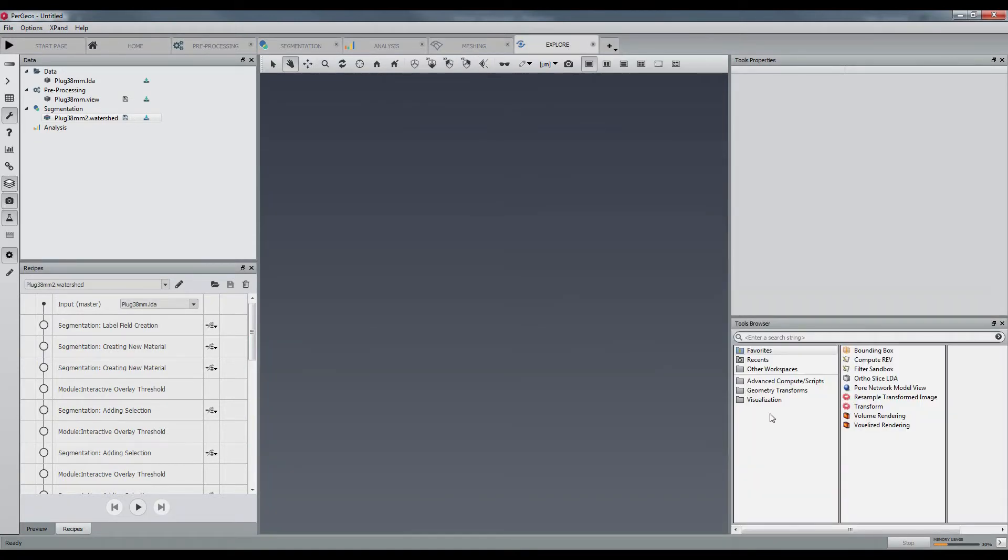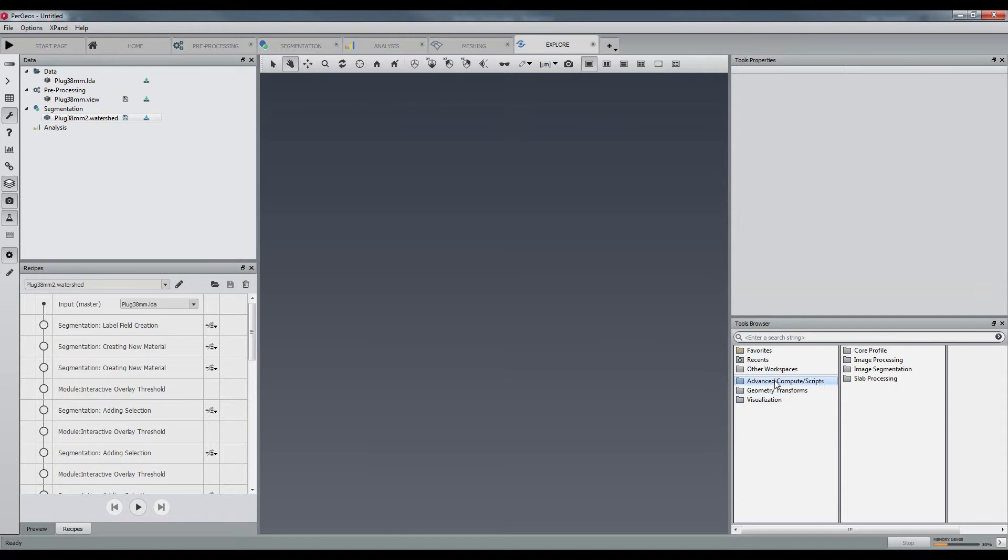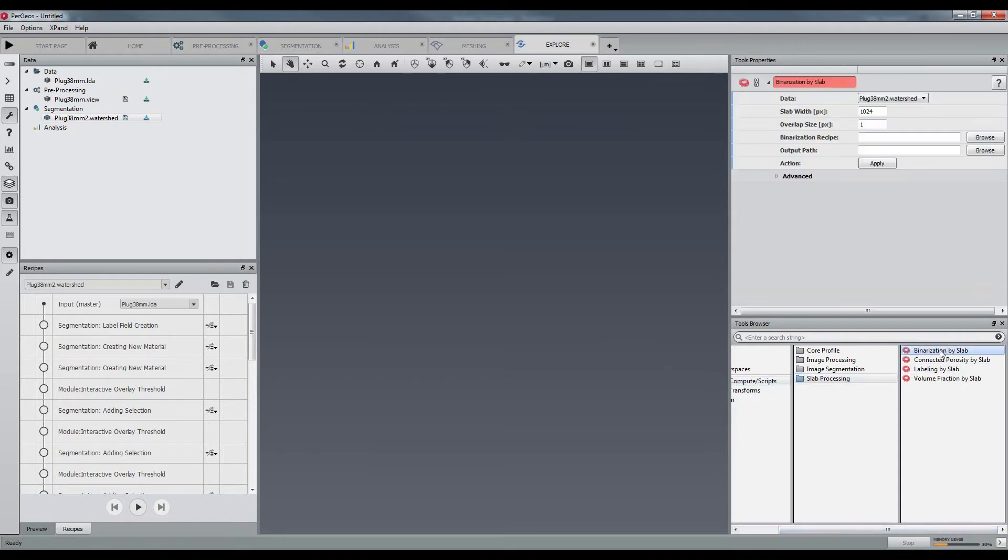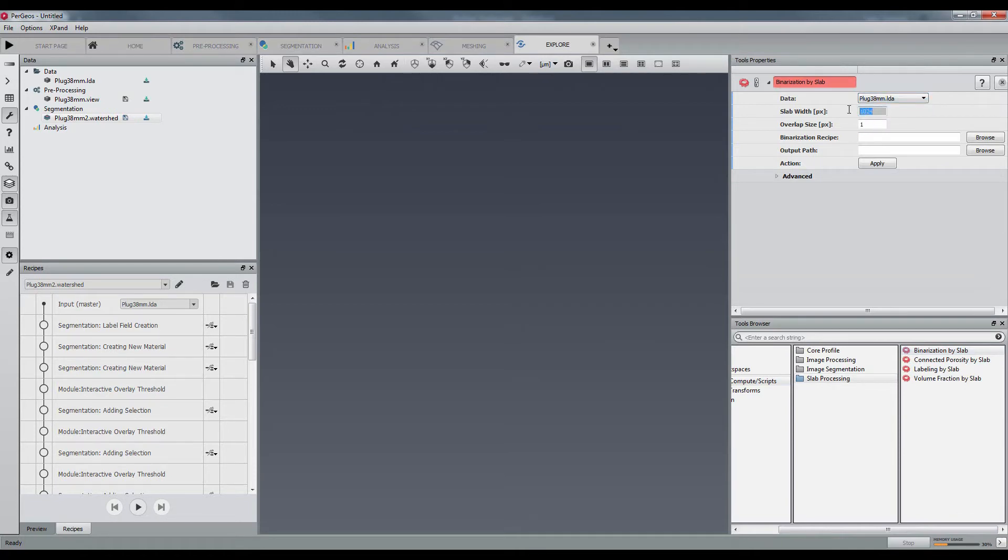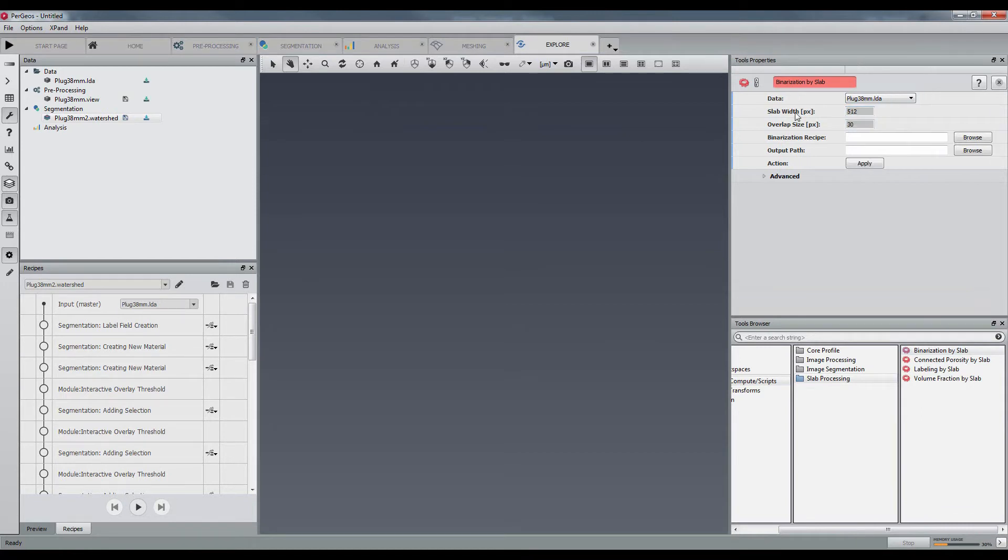In the explorer workspace, the binarization by slab module will be responsible to segment the whole data with the saved recipe. After having adjusted the slab width in overlap, the recipe is applied out of core.